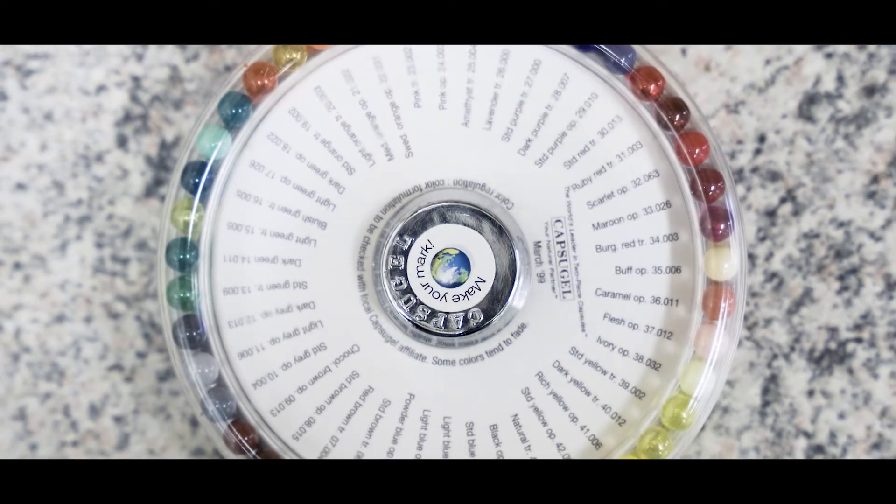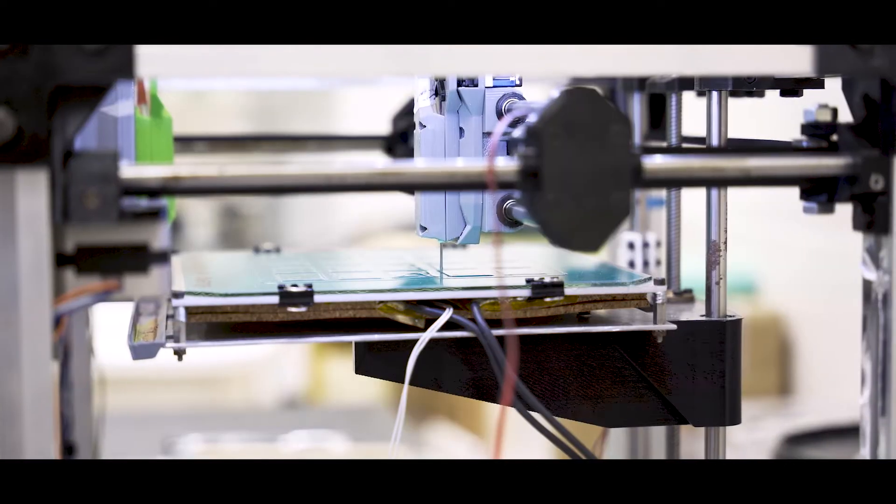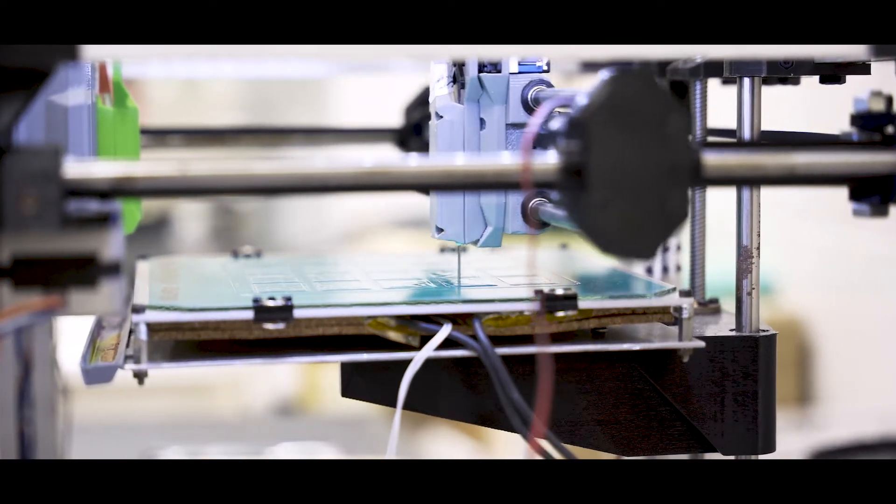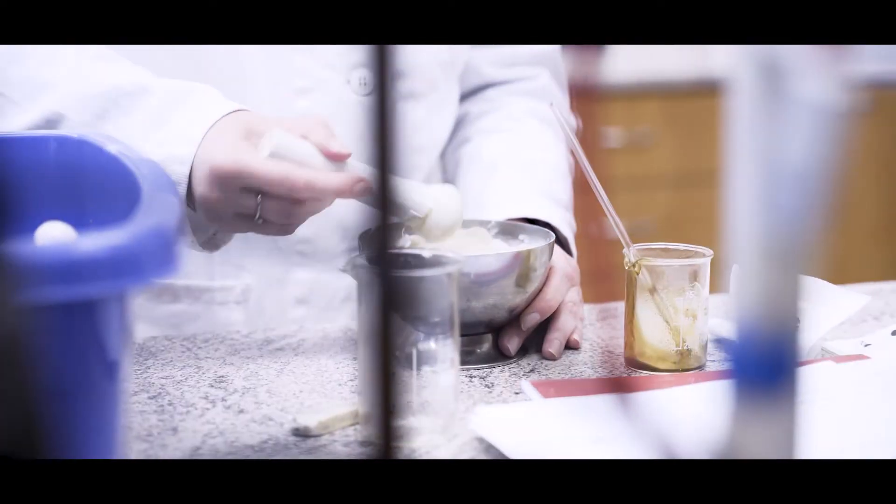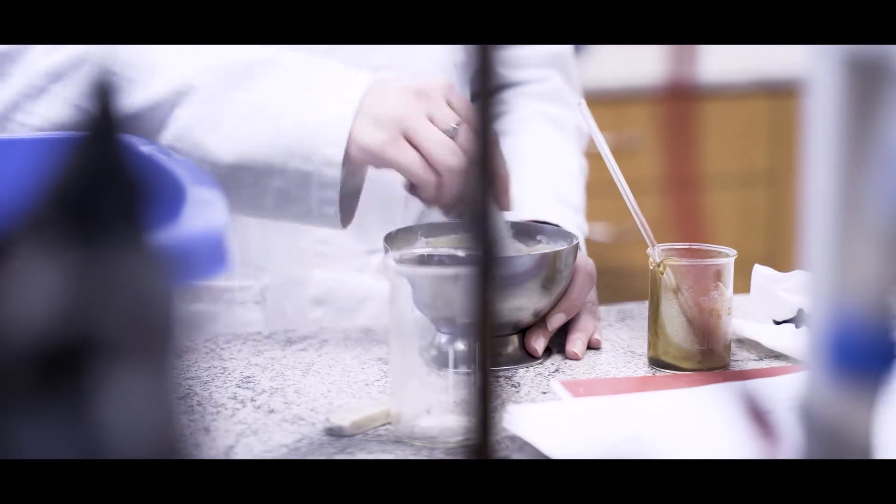We add excipient substances to the active substance and shape them with the help of specialized technologies into the form of tablets, capsules, vaginal globules, drops, films, ointments, syrups or other dosage forms.